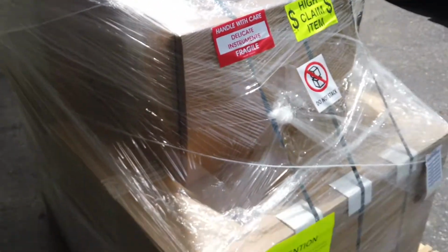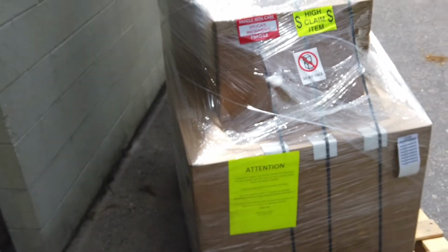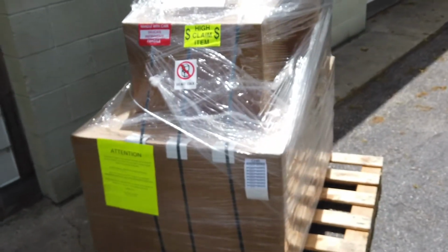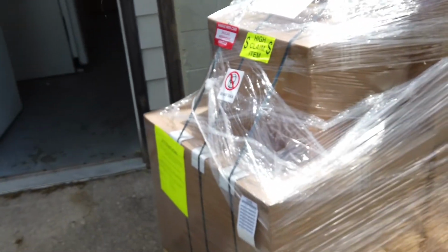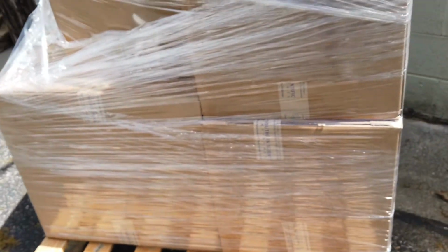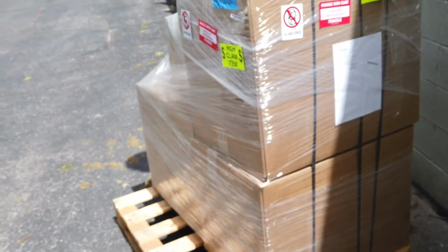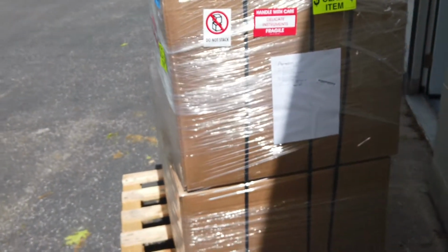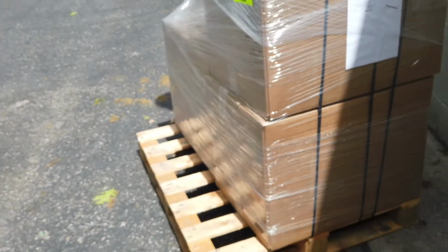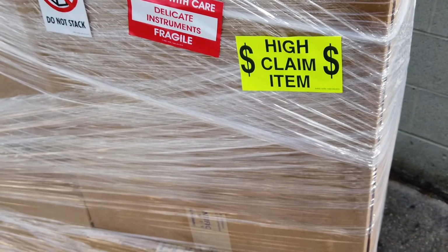All right. Here it is. It's our new GCMS. It costs $16,000, and it's gonna run volatiles. It's our first new one in a while. It's not new, it's still used, but it's way newer for us.